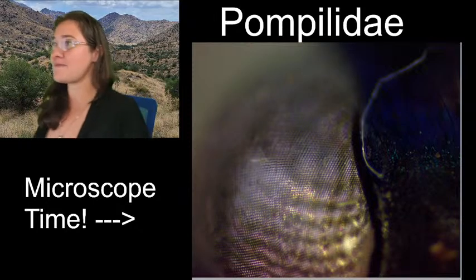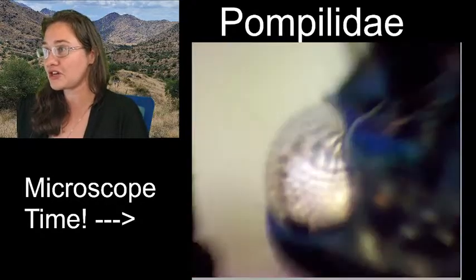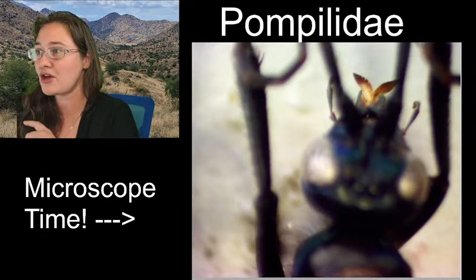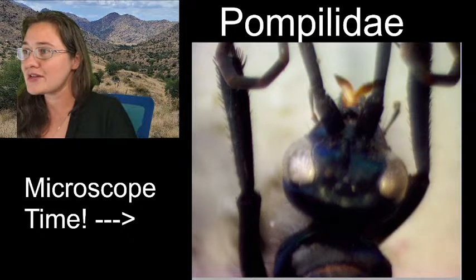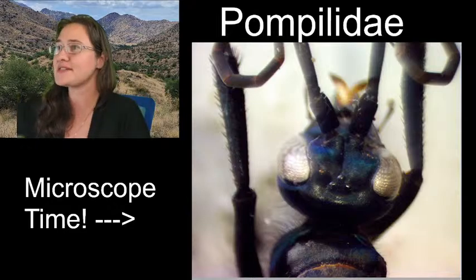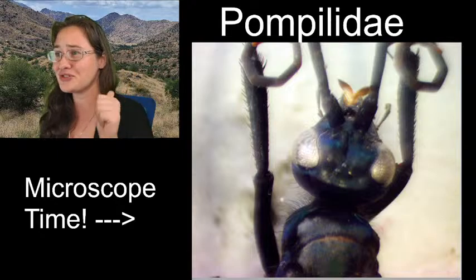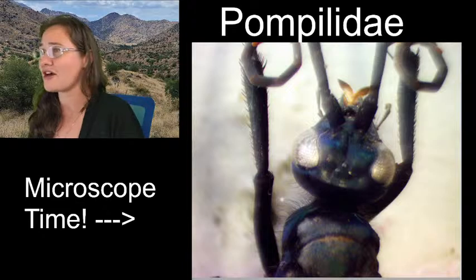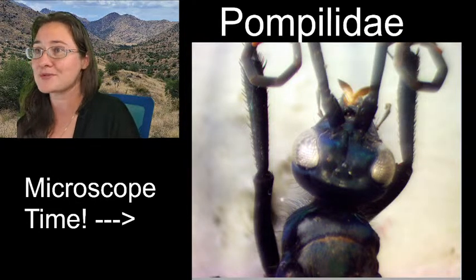That's the scientific name for the family of wasps, and a little bit later, when we're looking at a variety of the characteristics, I can show you the characteristic on this specimen of what makes them, at least in that family. I'm honestly not sure what the specific characteristic is to make it a Pepsis and not another species of pompilid, except that they are huge. A lot of these Pepsis are metallic blue black, and then they'll have either black or orange wings, and so they have these really, really absolutely beautiful colors.